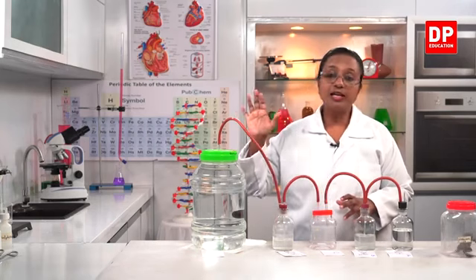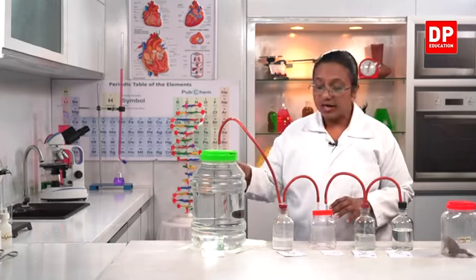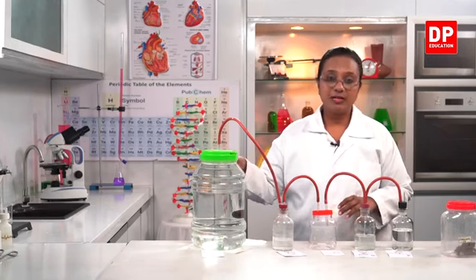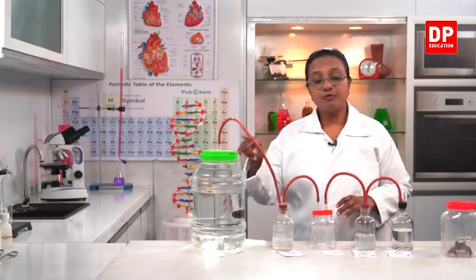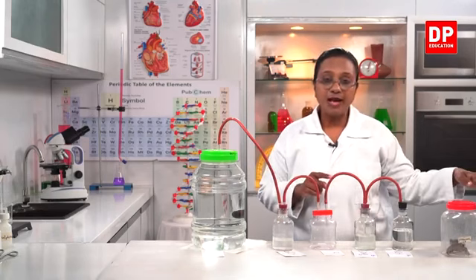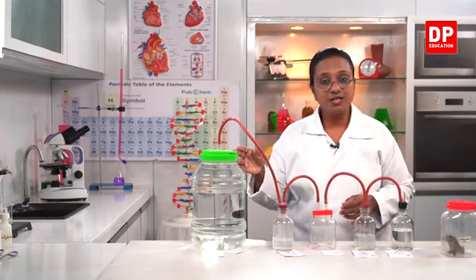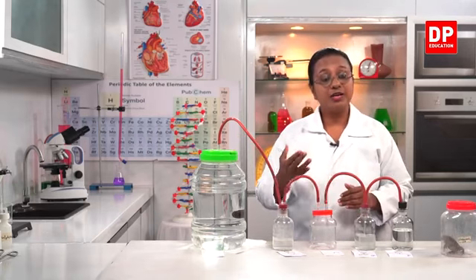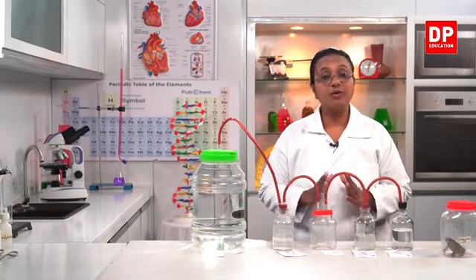And then we have bottle E, that comes with a tap, and it's filled with water. When I open the tap, you can see the water level will decrease. Because of that, there will be a space created, a vacuum. In order to fill up the space, air will flow from bottle D to E, C to D, B to C, and therefore from the atmosphere, from bottle A up to bottle E, there will be a continuous air flow. And from that, the frog will respire. So it will intake oxygen and release carbon dioxide. That is what we are going to test now.